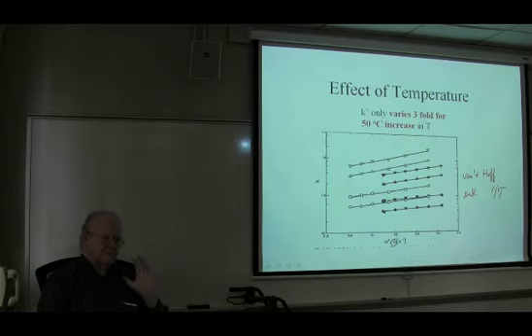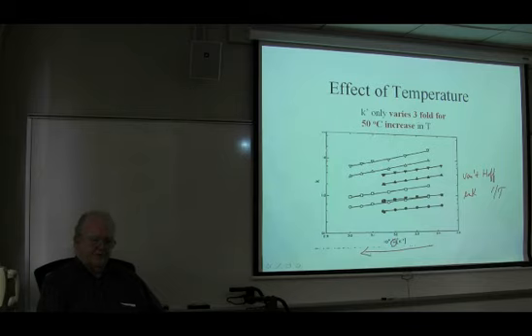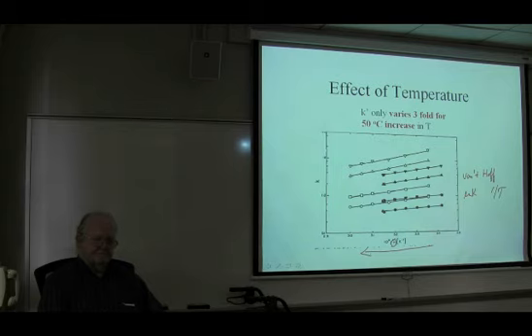For neutral compounds, meaning uncharged molecules in reverse phase chromatography, the slope is almost always positive. What that means is that as we go to higher temperature, 1 over T is getting smaller in that direction. So as we go to higher temperature, we get a decrease in retention factor as we increase temperature in reverse phase chromatography. It's not always so simple because ionic compounds frequently show the opposite trend, even in reverse phase chromatography.